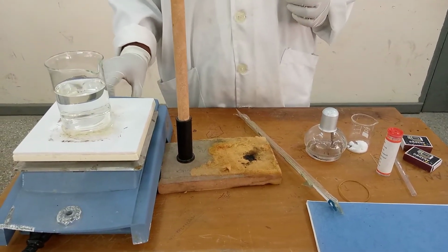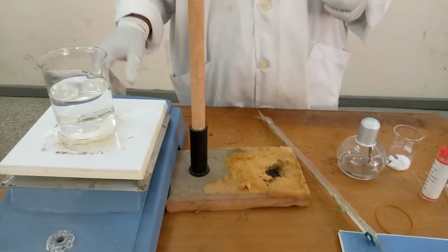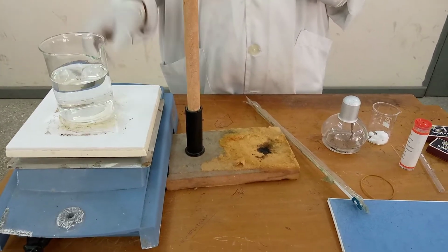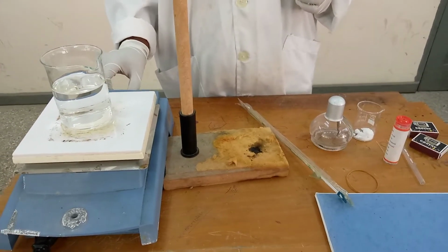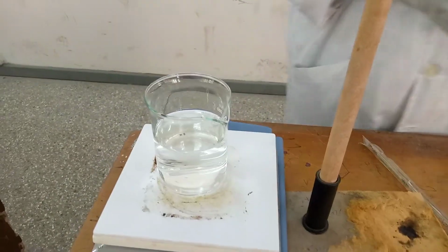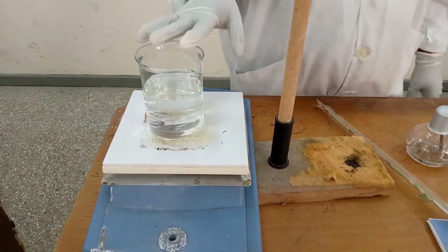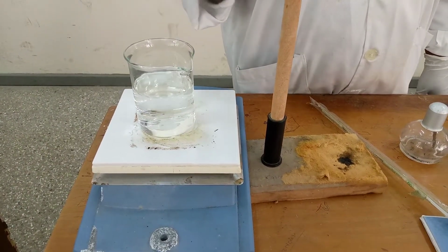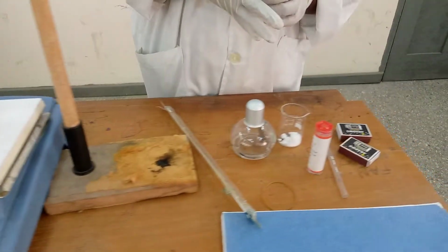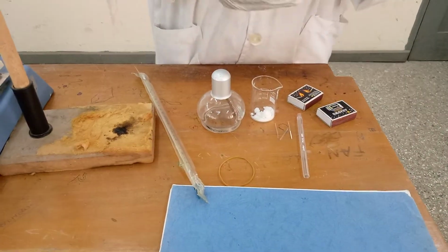So I'm going to turn on the hot plate. There is a thermostat on the hot plate, so I want to heat it at a fixed temperature, and I'm setting it to 150 degrees Celsius. So now I've turned on the hot plate, and I'll wait for the paraffin oil to heat up before we dip our sample in it. Okay, so now the next step is to seal the capillary tube.